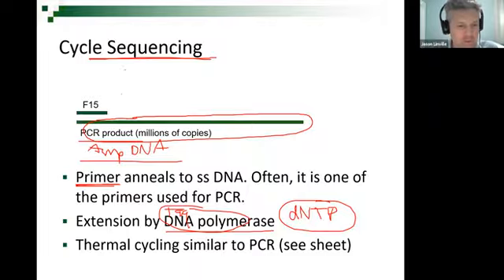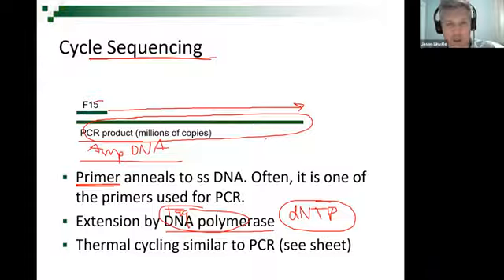Here's a little foreshadowing. This shows our PCR product and our 1 primer. You're going to run the sequencing reaction in one direction. You don't want to run it both forwards and backwards. We're not going to get into a whole lot of details about that, but just 1 primer. So we got everything: DNA, except it's amplified DNA, primers, except it's 1 primer, Taq polymerase, dNTPs.